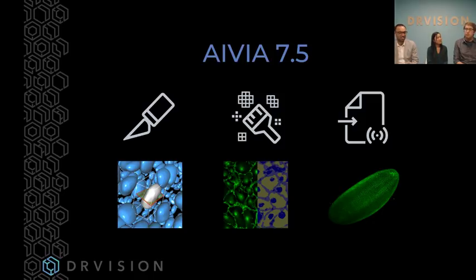Deconvolution is kind of different because you're going to be using a point spread function that you either have to measure beforehand or theoretically define. With the pixel classifier, you don't have to worry or know about that ahead of time. It will enhance your image in a different way by looking at different features instead of using the known knowledge of a microscope.